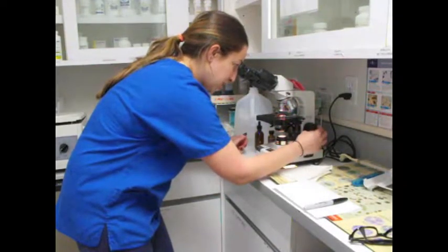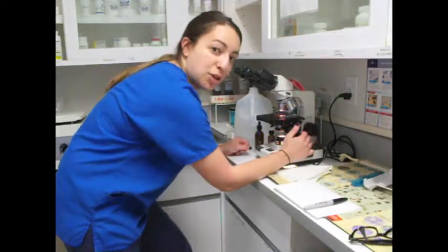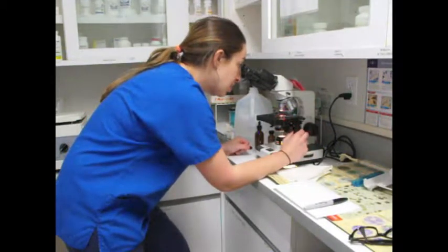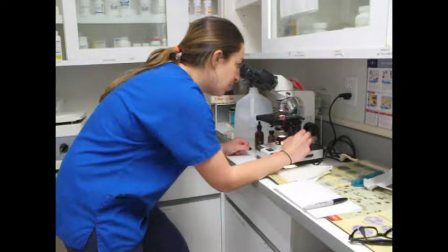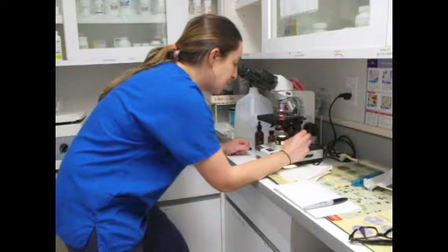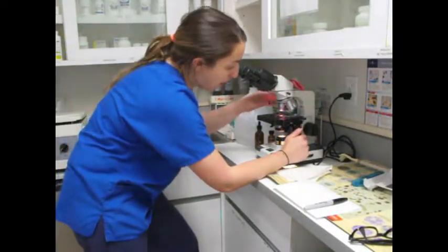You also want to make sure that the slide is properly stained. If it is not, you can go back and restain it. So I'm just doing my scan here. Okay. So now, of course, this is too far away to see exactly what types of cells they are. So then you want to go to the 40-45 power lens.